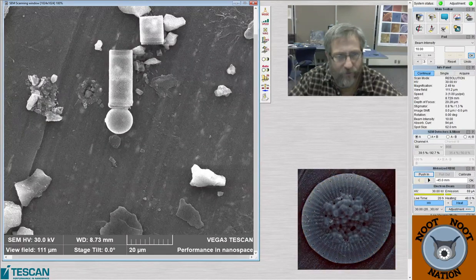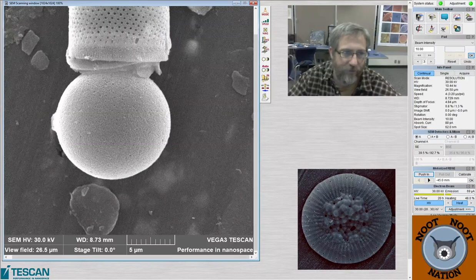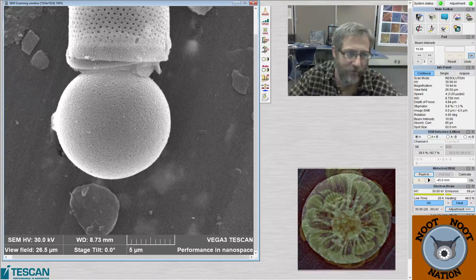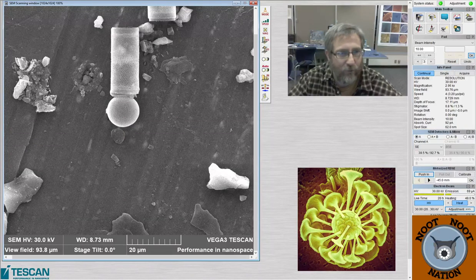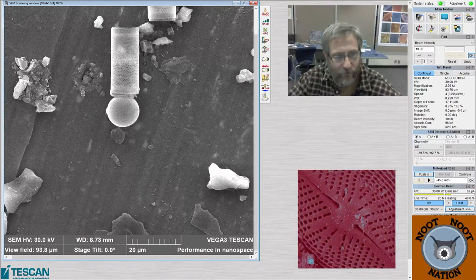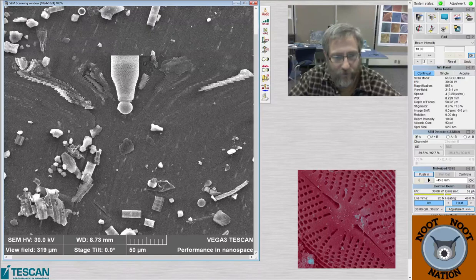Oh no, that's not a chrysophyte. I'm not sure, maybe it is a chrysophyte because that looks like a piece of a chrysophyte. Yeah, I think it's just stuck on the end of this. Sometimes diatoms will make a new cell, like when they're growing through sexual reproduction, they'll produce a big round cell like this on the end. It's just weirdly placed.